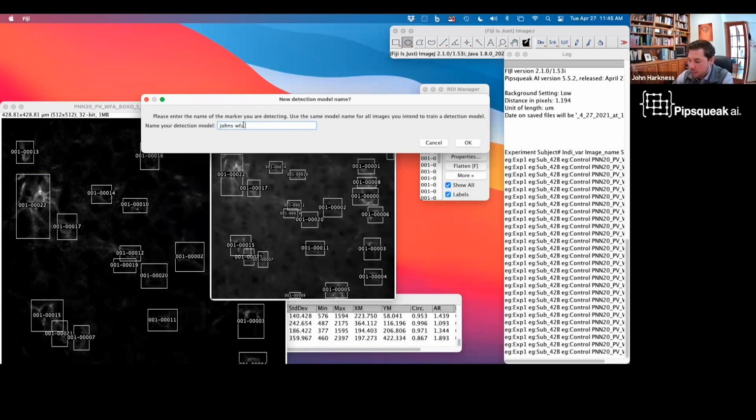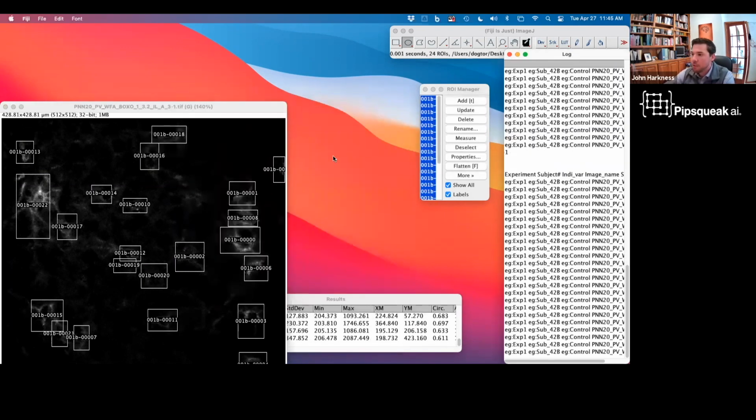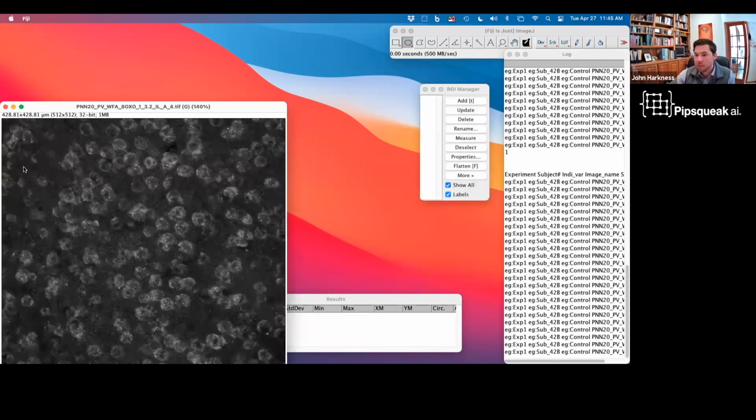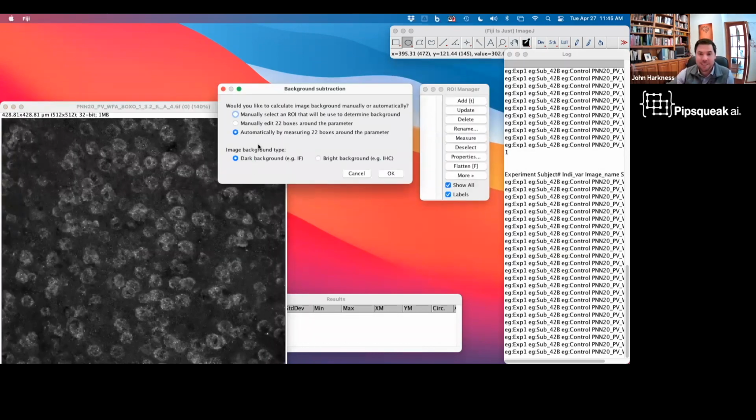Basically what you can see here is that we're able to do that custom model generation really from wherever you are in the process. And I think that's something that's important to making this as smooth and as easy as possible.